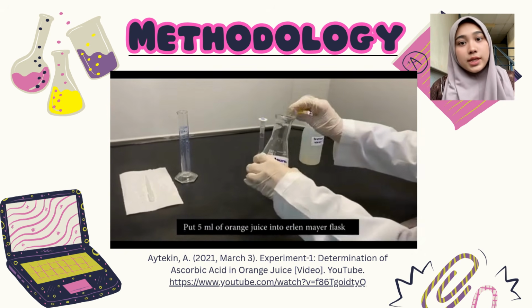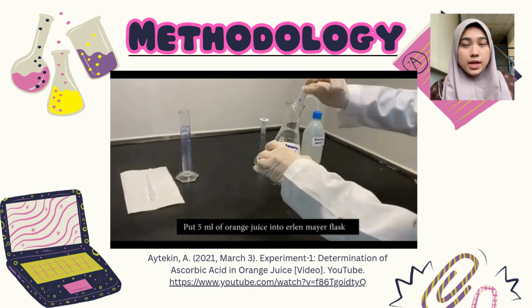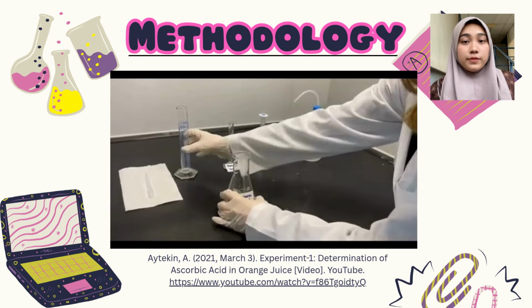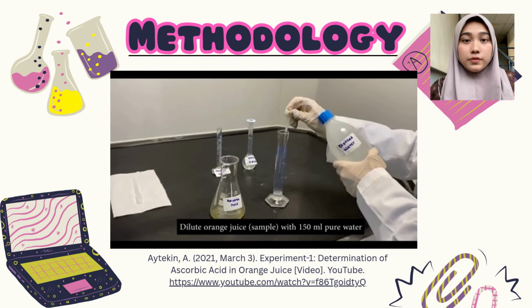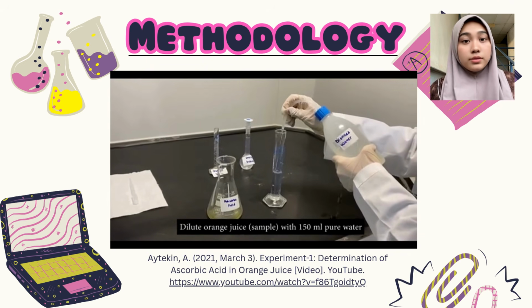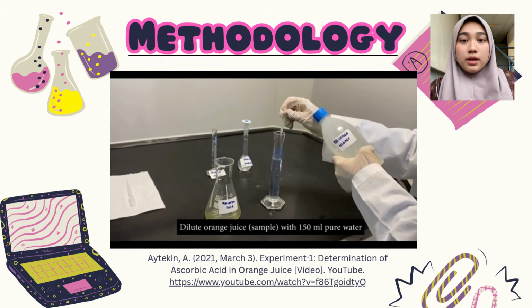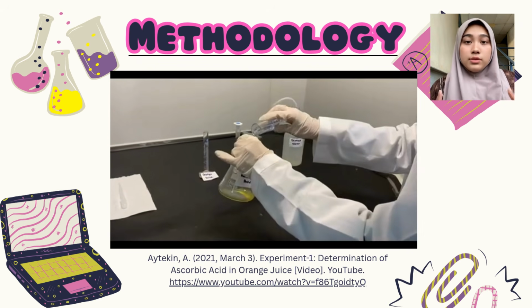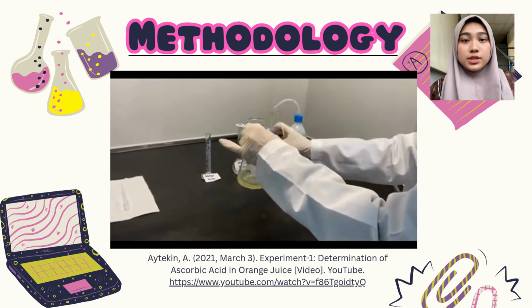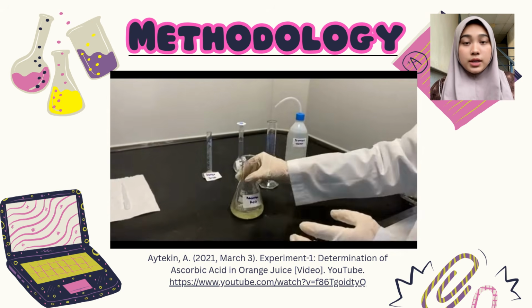First, we measure exactly 5 ml of the orange juice sample using a pipette and transfer it into a clean Erlenmeyer flask. Next, we add 150 ml of distilled water to the flask. We do this dilution to thin out the intense orange color of the juice, which will make it much easier for us to see the final color change later on.